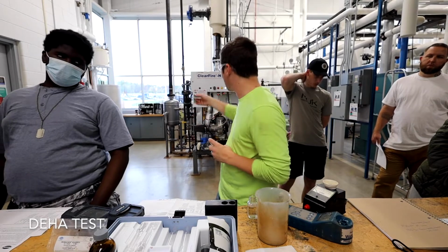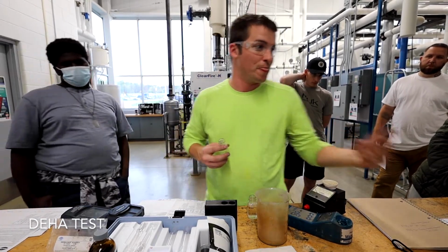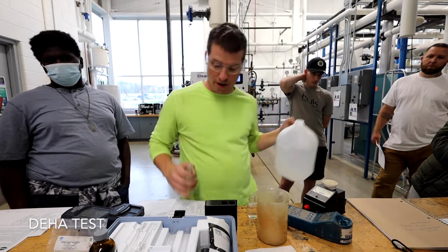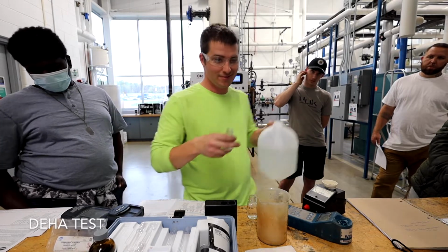And in my little kit, I have a little squeeze bottle in there, a supply of RO water. Not a problem. So I just wanna make sure that I'm... Yeah, sorry, on the blank. Thank you for catching that. And that's true. Yeah, look, she got me.